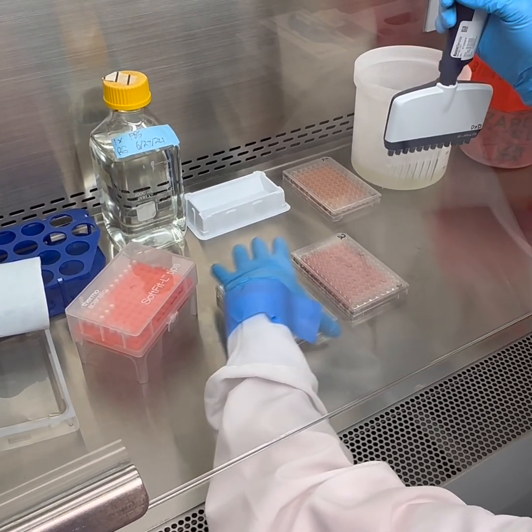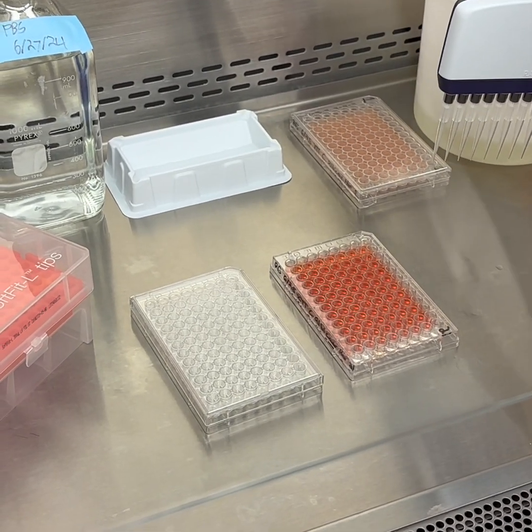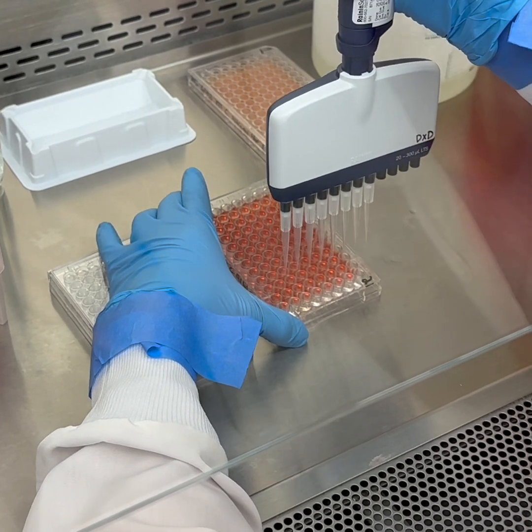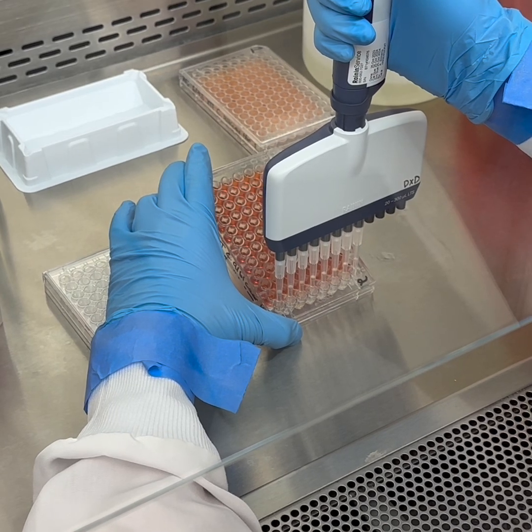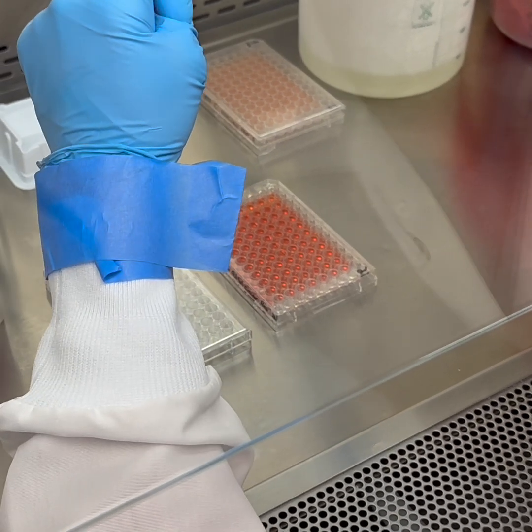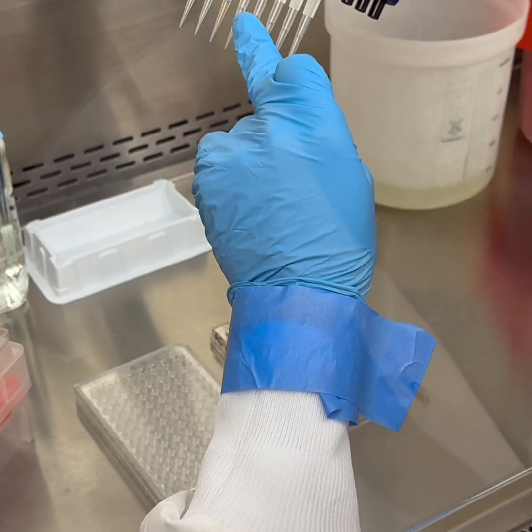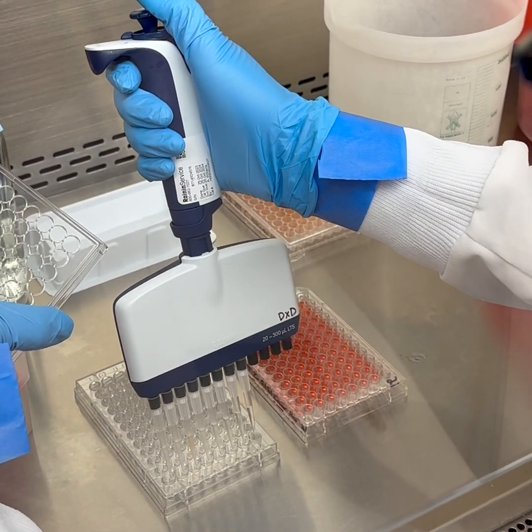Okay, so I'm going to go from most, or I guess least metabolic activity to most metabolic activity. So it's going to be from lightest to darkest. So I'm going to start with the negative control, and I'm taking 75 microliters out. You'll see I must have gotten some drip from row F into my negative control, as there's some metabolic activity there. So just something to think about.